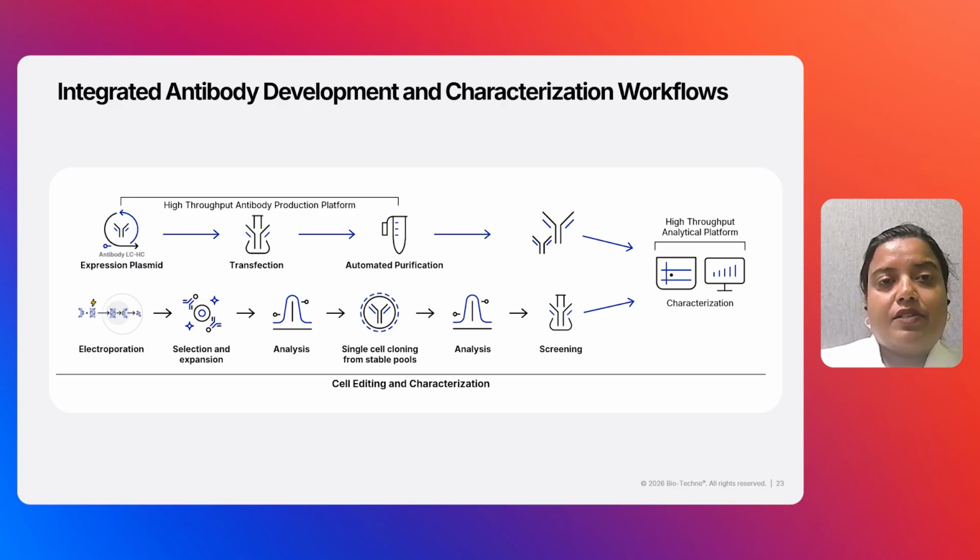Herein, the TC Buster transposon technology enables the rapid development of a stable, high producing CHO-K1 cell line expressing a CD28 monoclonal antibody. The AMBER 250 high throughput bioreactor allowed efficient testing of media and temperature effects using minimal material.